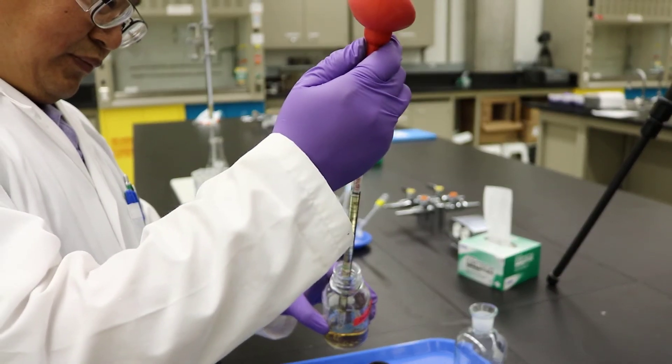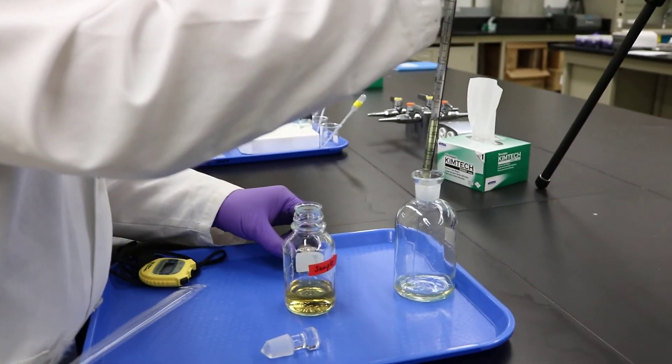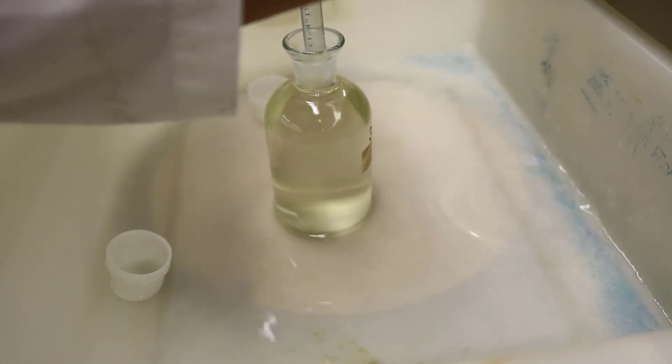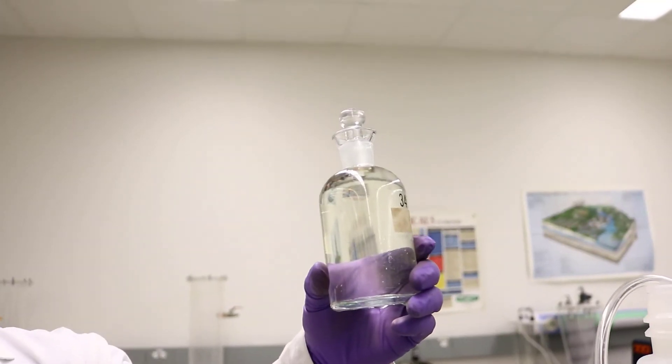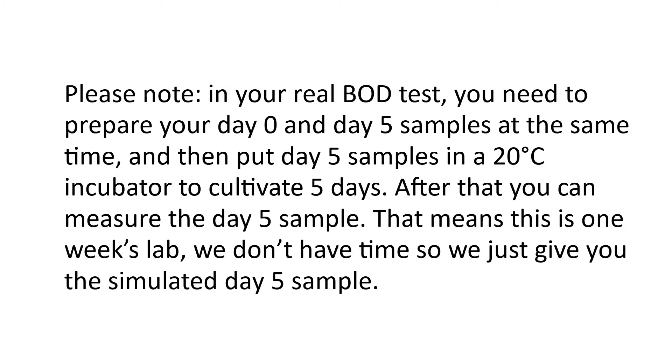To prepare a BOD sample, transfer a 10 milliliter sample into the BOD bottle and slowly fill in the dilution water. Put a stopper on and don't overfill it. Today we'll just show you the general procedure. The technician has already prepared a simulated Day-5 sample. You will only need to prepare a Day-0 sample. Please note, in your real BOD test, you need to prepare your Day-0 and Day-5 samples at the same time, and then put Day-5 samples in a 20-degree Celsius incubator to cultivate for 5 days.